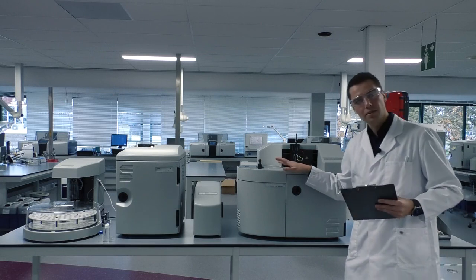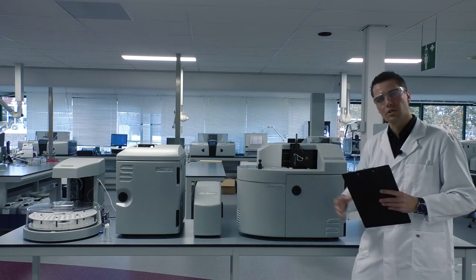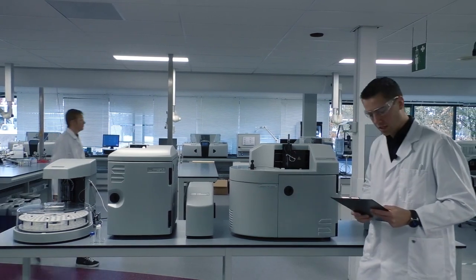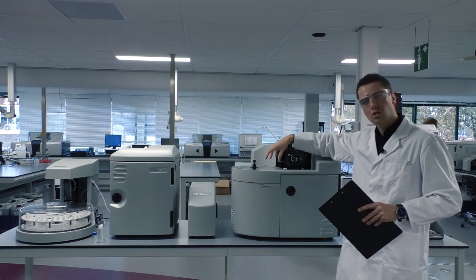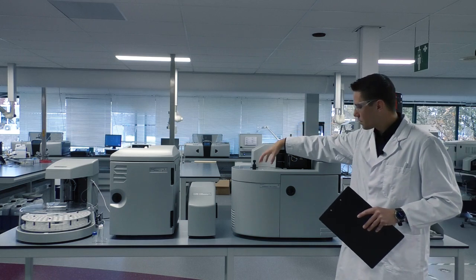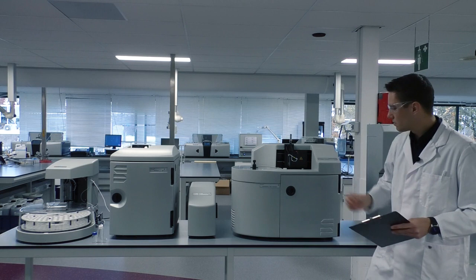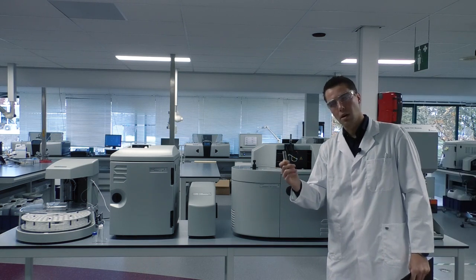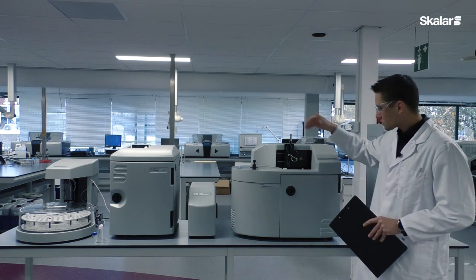So here we have the FORMACS HTI. The I stands for a difference in injection principle compared to the brother next to it. The difference in the injection principle is that this uses a direct sample introduction. So the sample is set up and the auto-sampler is also integrated into the instrument. The samples are set up either in closed or in open cups, so a 10 ml closed cup or an open cup.